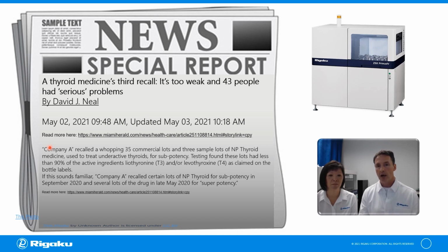This is a recent article, from May of 2021, this month, where they've had to recall a lot of batches because 43 people had serious problems. Not just a recall due to a different potency, but there were actually adverse effects. The same company had previously recalled for super potency as well as subpotency a year ago. So it is a known issue, and finding different or easier ways to test it in manufacturing would be beneficial.